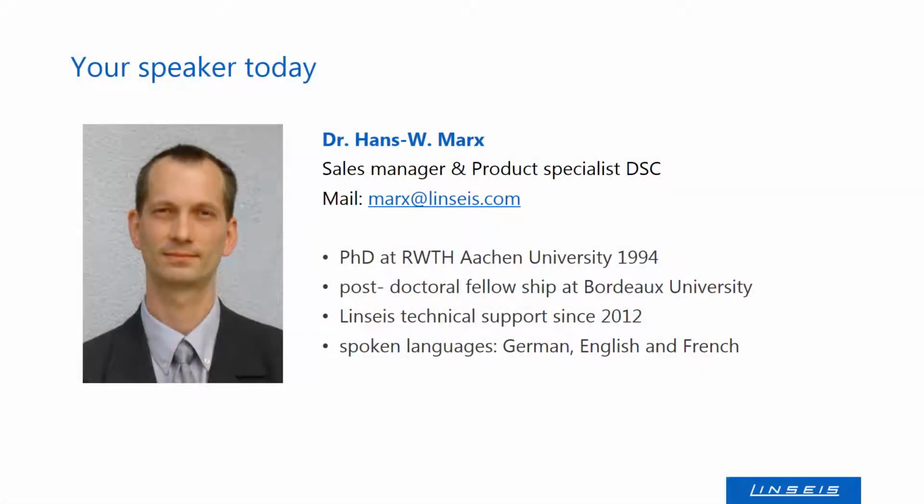My name is Hans Marx. I'm the product specialist for DSC at LINSEIS. I did a PhD for chemistry at the Aachen University in 1994, followed by a postdoctoral research fellowship at the Bordeaux University, and then I became a technical support manager at LINSEIS in 2012. My spoken languages are German, English, and French, and I'm guiding you through this presentation.